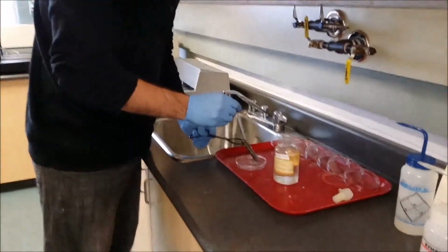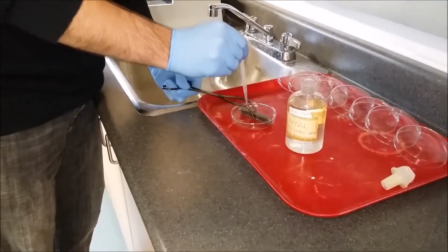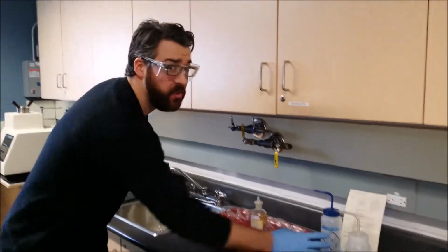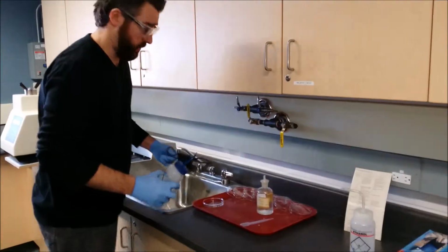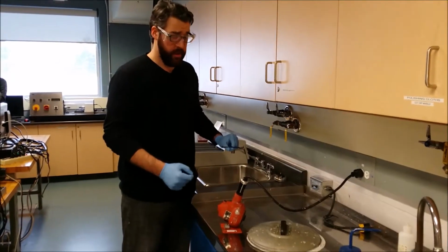Using a petri dish to catch any excess, just put it on there and drop it in. After 45 seconds, we want to use distilled water again. Give it a rinse. We need to dry this and then go to the microscope.